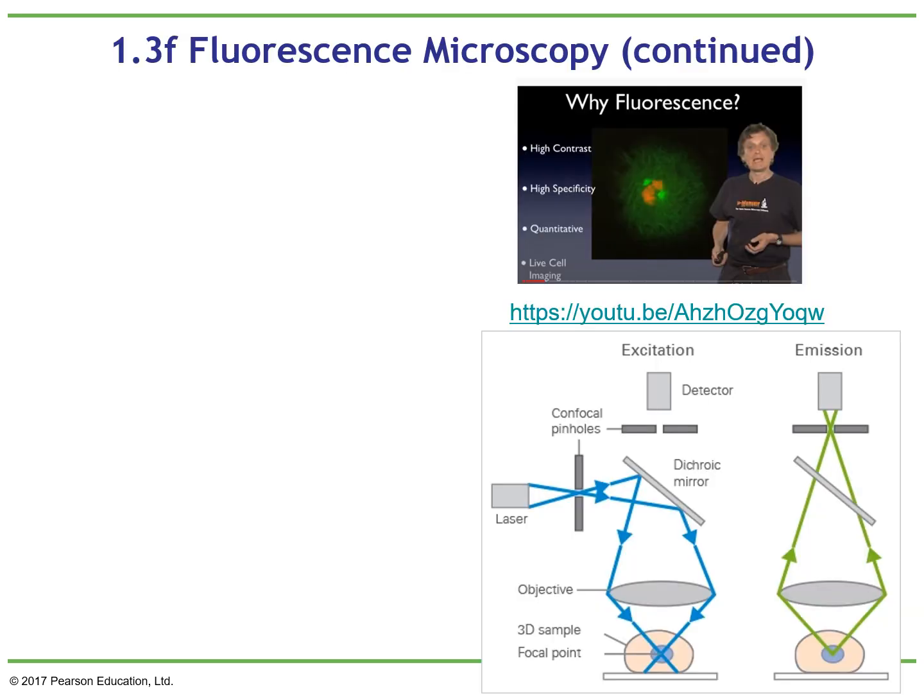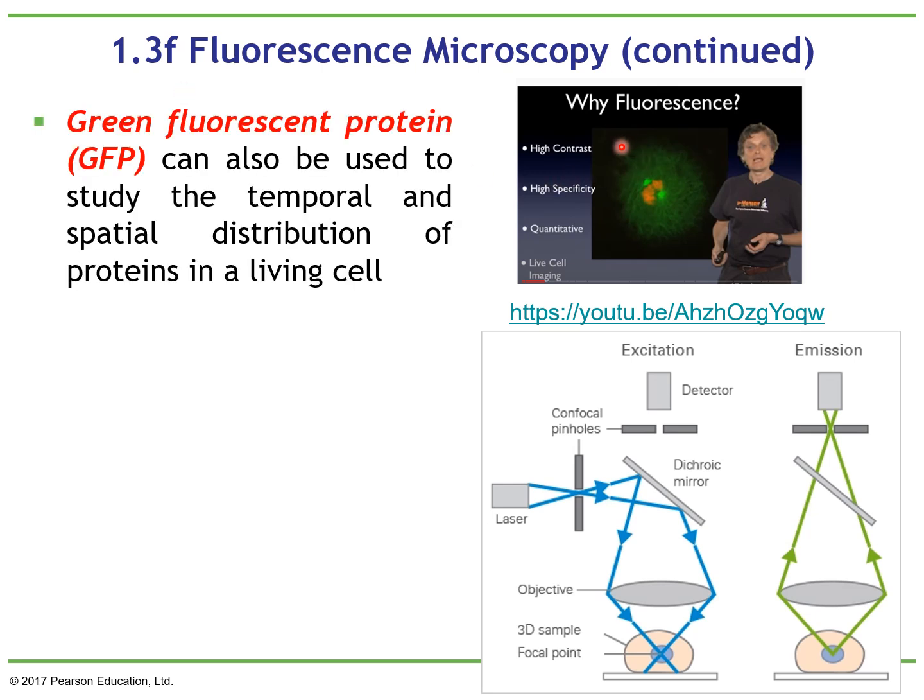So here I just recap all the information about confocal microscopy. One of the advantages of confocal microscopy over wide fluorescent microscopy is that you have much clearer samples with less blur, so it is much better to quantify what is happening. You can see the spatial and temporal patterns of the distribution of the protein. In the other one, you see that the chromosomes are separated, but with the confocal microscope, you can see much more clearly in which direction they are going. You can quantify them, you can see that reduction in the fluorescence. In the other one, there will be just too much light. So this one is better for quantification.